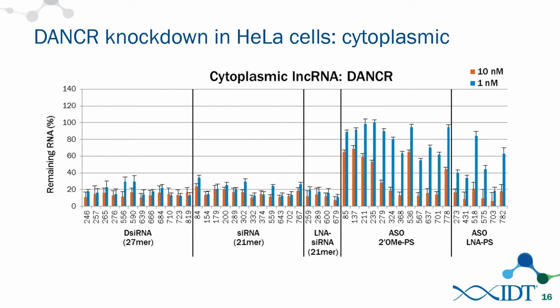And so it is difficult at this point. This is one of the reasons why there hasn't yet been a good algorithm to predict a good antisense oligo, basically. There's a certain amount of art to it. There is, and it takes a while to design these things, but we are currently trying to train an SVM right now in order to design these more efficiently.